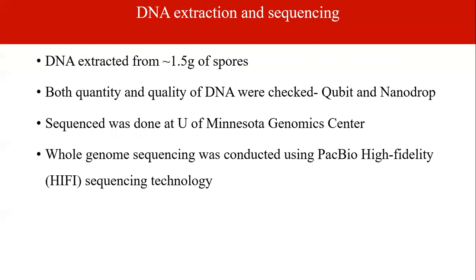DNA extraction was done from 1.5 gram of spores. After the quantity and quality of DNA were checked, sequencing was done at the University of Minnesota Genomics Center. Whole genome sequencing was conducted using PacBio high-fidelity sequencing technology.